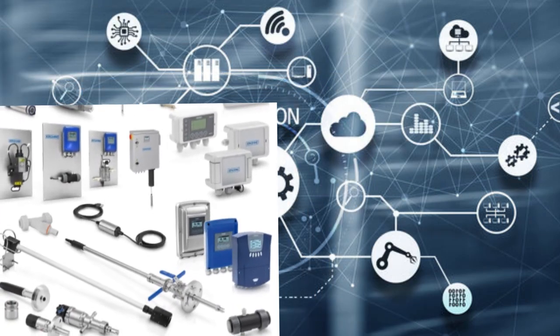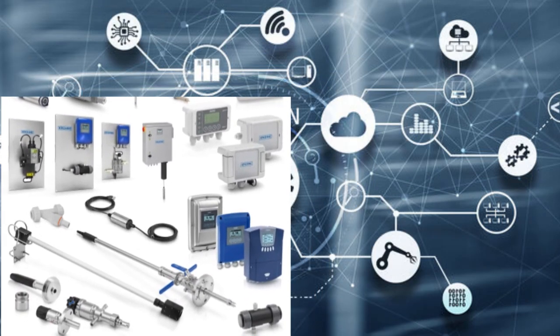So if the turbidity is higher than 4,000 FNU, the sensor can't really give us a good reading, right? What happens then? Right, if it's too high, the readings won't be accurate. That's why it's super important to choose a sensor that can handle the levels you're dealing with. Sometimes you might need a totally different type of sensor for really high turbidity.